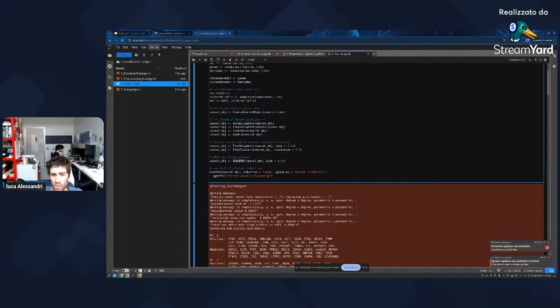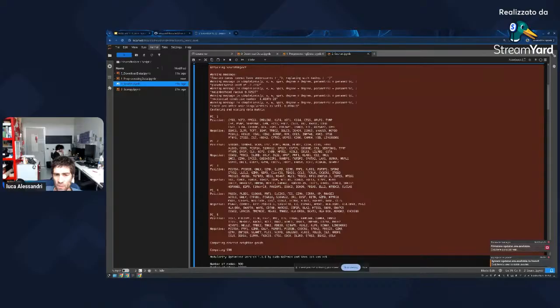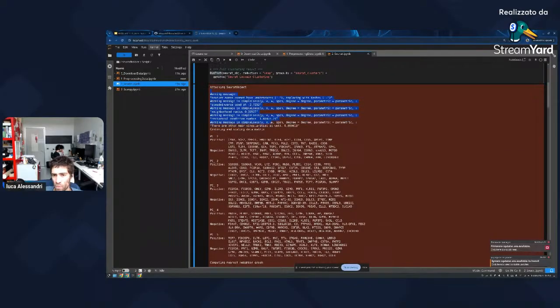And then you run the UMAP. Now, the UMAP is actually what is used by Seurat for the visualization. It's kind of projecting again from a high-dimensional space to a two-dimensional space, but it's not linear like the PCA. It is more precise and it is what is used so far for single-cell RNA-seq. And then you can plot, so we can see what we have. We have a few warnings. You're not happy with the code if you don't have a few warnings.